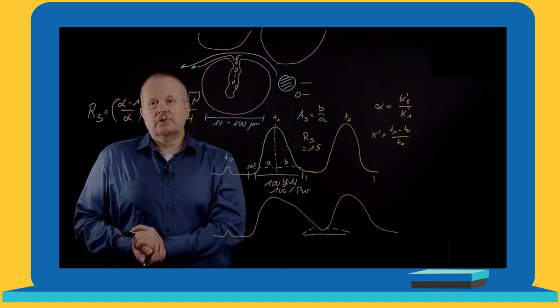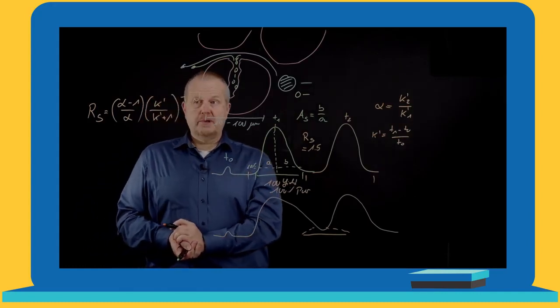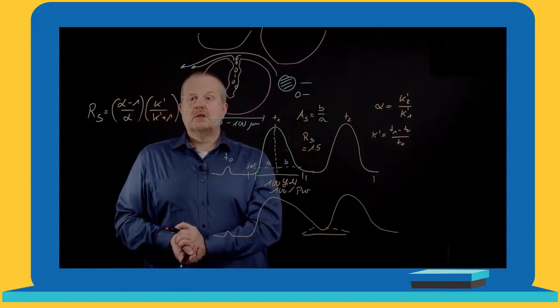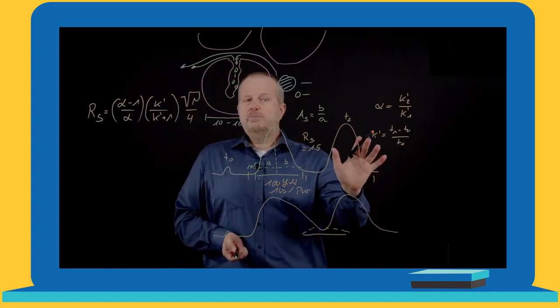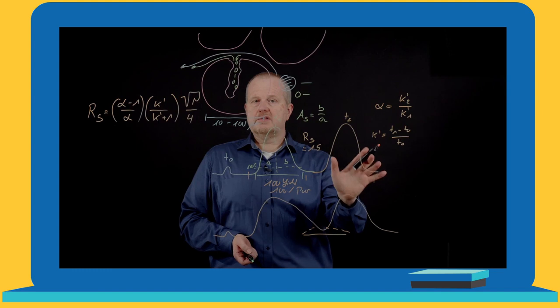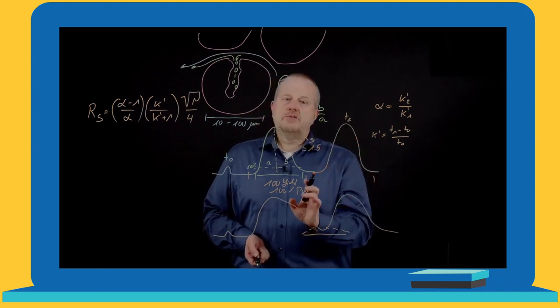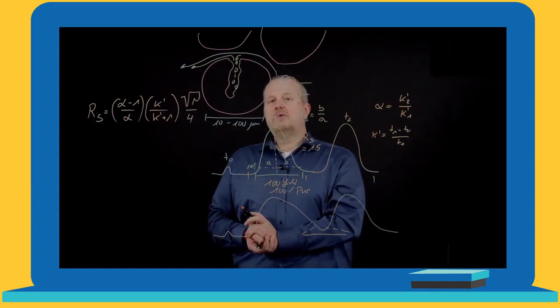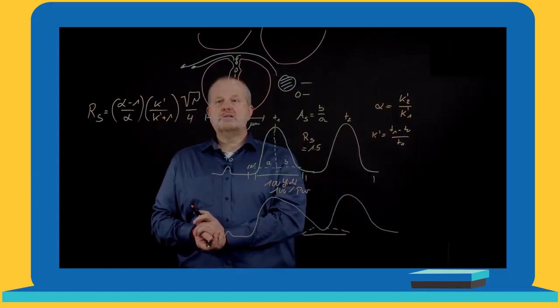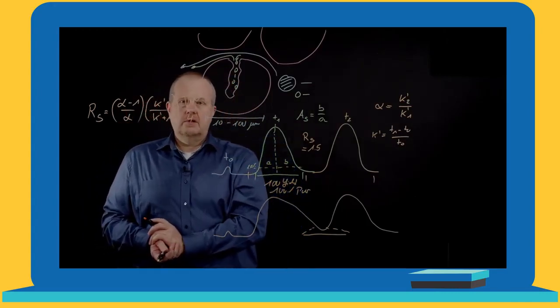The most important one, or the one which has a lot of drawbacks, is to increase the retention. If we just increase the retention of our chromatogram, we need a longer time, we have a longer cycle time, we need more mobile phase, and because of the diffusion, we broaden our peaks. So in principle, what we should optimize is efficiency and selectivity.